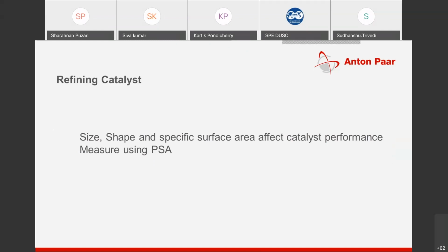So I know IOCL is using it for all these applications. For grease also they are using particle size analyzers. They are using it for phase separation. For phase separation, they are using a particle size analyzer. And for catalyst, they have been using it from a long time back, for more than 18 years, this particle size analyzer for controlling the catalyst.